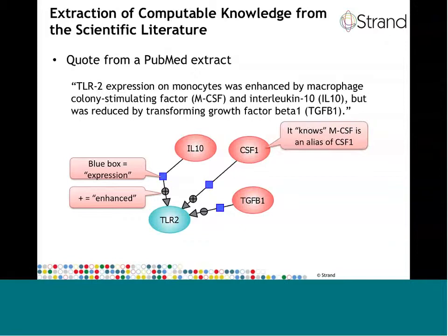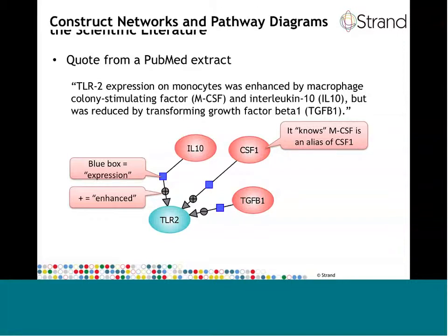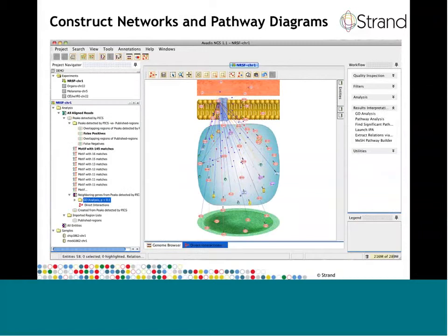The information that was extracted from the literature like this can now be used to construct completely novel networks of interacting genes, or better said, proteins, as shown in this example. It shows the proteins and their interaction partners, which can include small molecules as well as complete processes such as cell death and cell division, etc. Even their typical location for proteins can be indicated as is shown in this example.